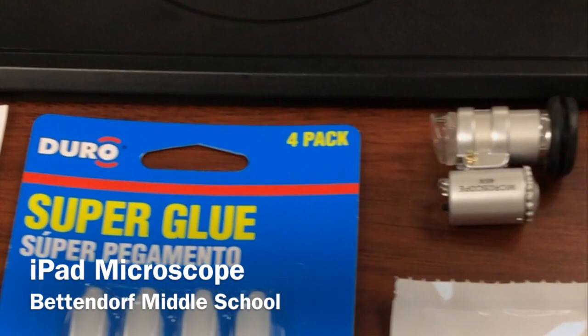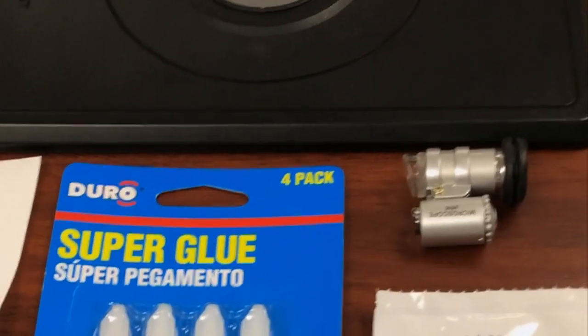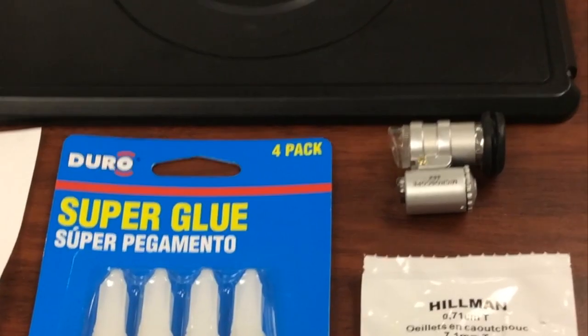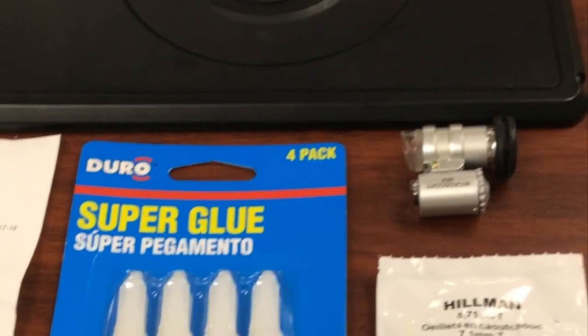This is CoffeeChug and I'm here today to show you how to turn your iPad into a microscope. I did not create this idea — I'm just simply sharing it. This idea has been around; some people claim that I created it, but I'm not claiming that. I'm just going to show you how I did it.